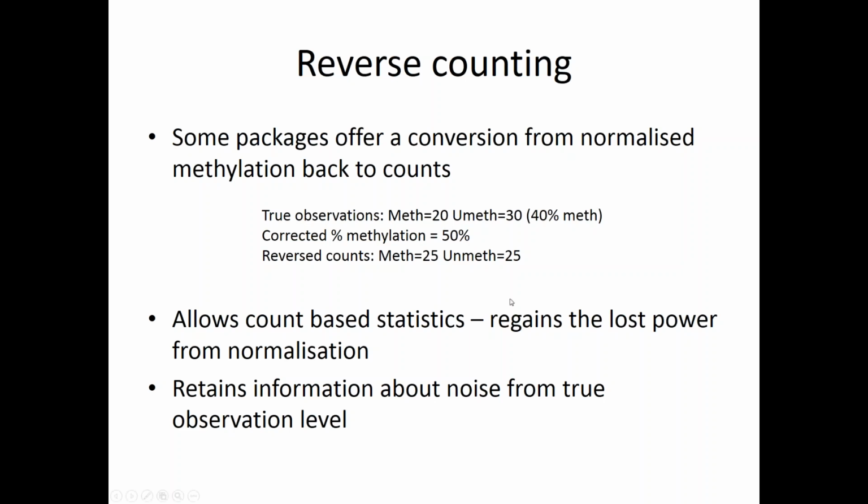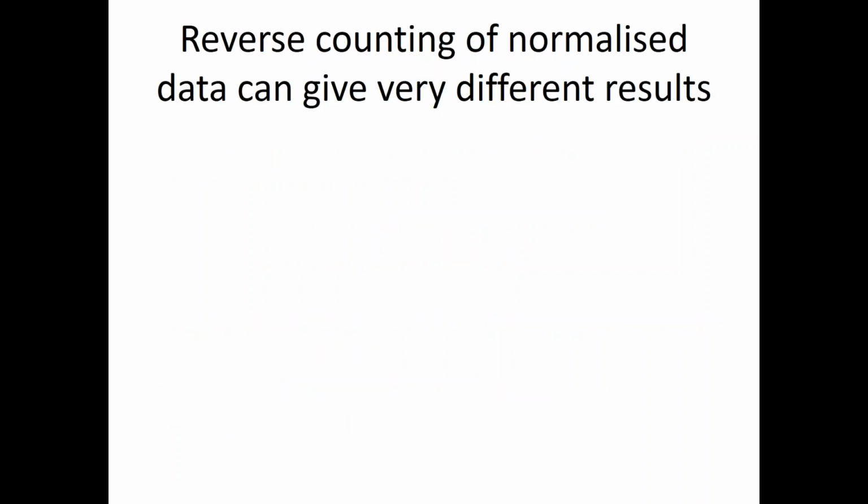Okay, so the nice thing about that is that it adjusts for the corrections, but it retains the correct noise profile from the level of observation that it has. And this can give you quite different answers, but they can be quite biologically relevant. So here's an example that we had earlier in the year.